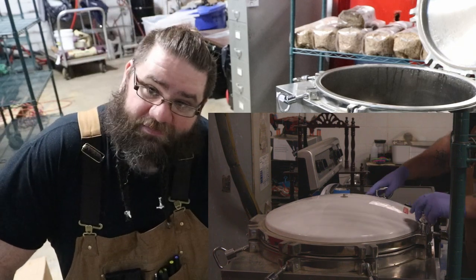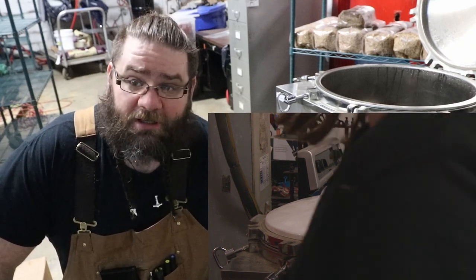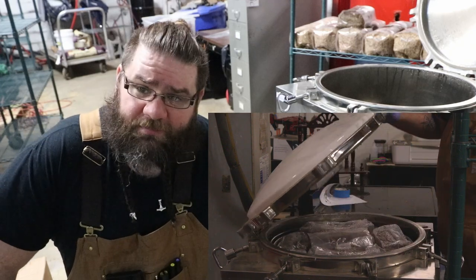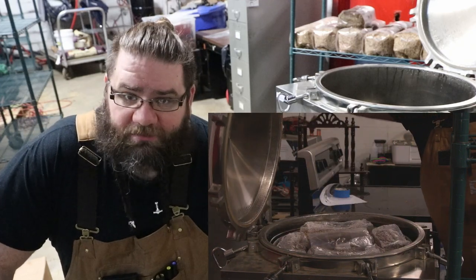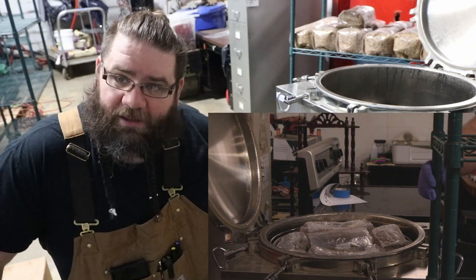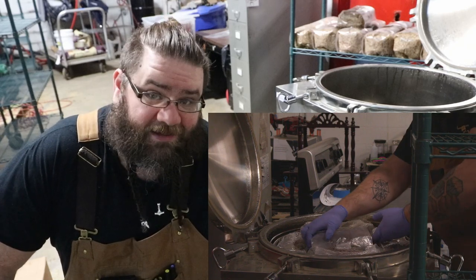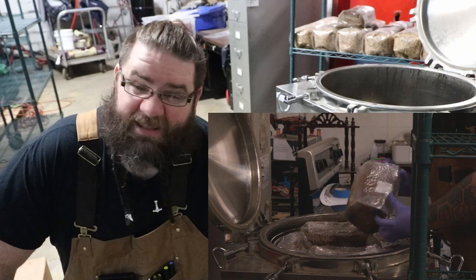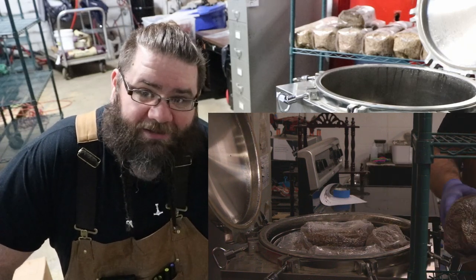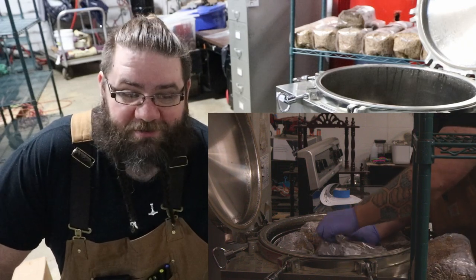I've had jars bust in this, two since I've been using this thing, after probably hundreds of jars at this point. And those two jars that busted, they didn't go anywhere, the liquid didn't go anywhere, everything stayed in the bag, and that's exactly the point. Glass can damage this thing if it busts in there and scratches one of the sensors, but as long as you have that contained, it seems to work really, really well. I can't promise you that it'll maintain your warranty, but it will help you produce a lot of work in a very short time.